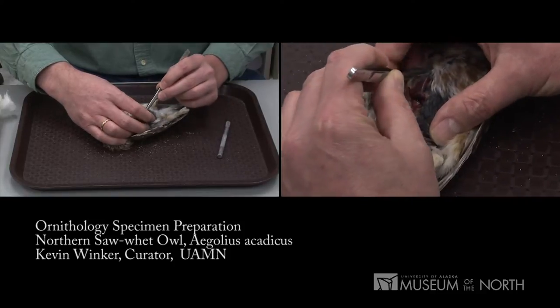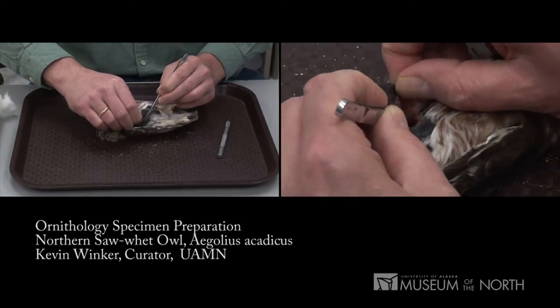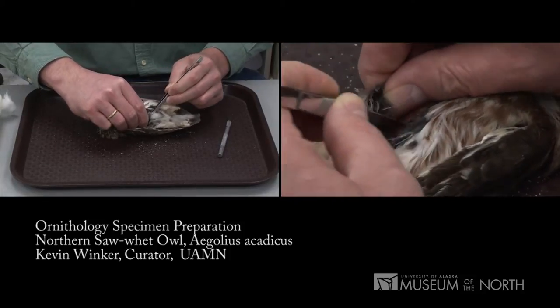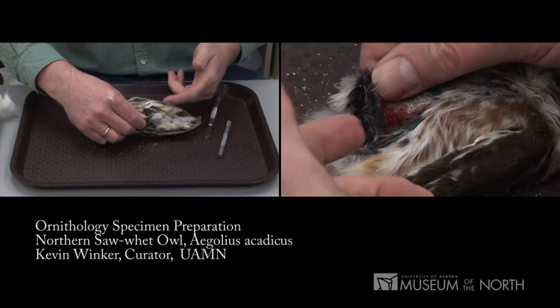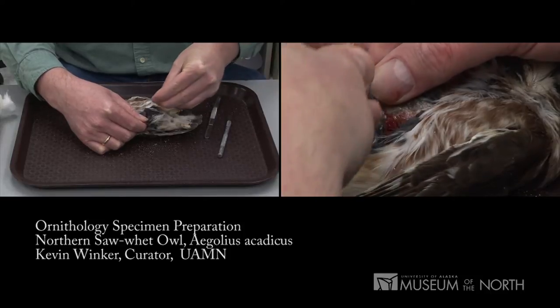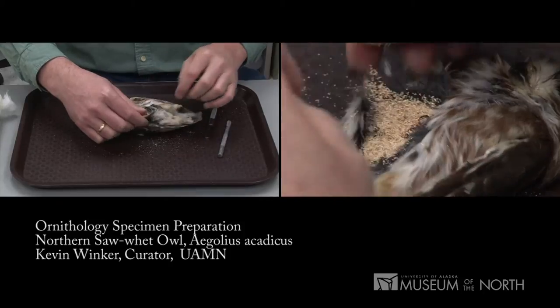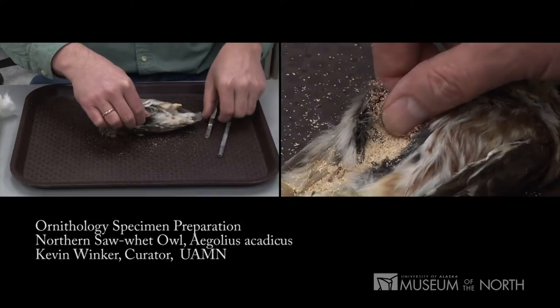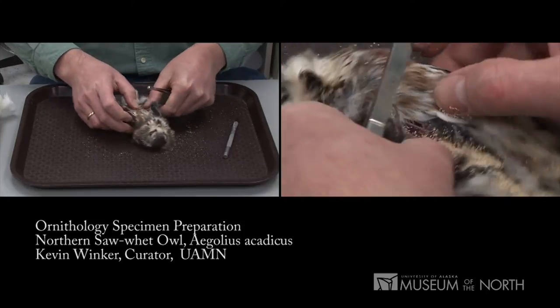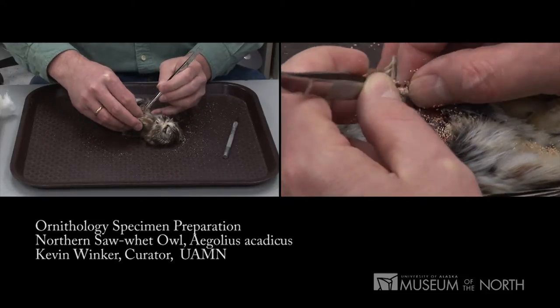I'll lift the edge of the skin up away from the bird and use the closed forceps as a probe to push the meat away from the skin — never pulling, always pushing. Now you can see juices are visible, so I put some corn cob dust — or other absorbent like corn meal, or even potato starch as they use in Russia — to absorb those fluids and prevent them from getting onto the feathers. By feel it's quite easy to continue easing the skin away from the body.